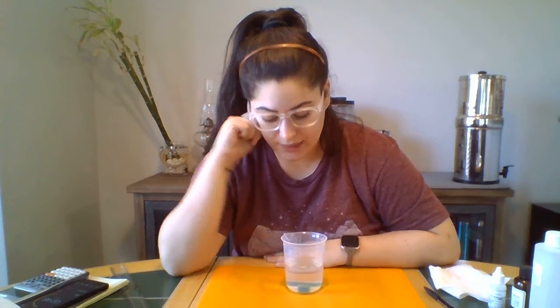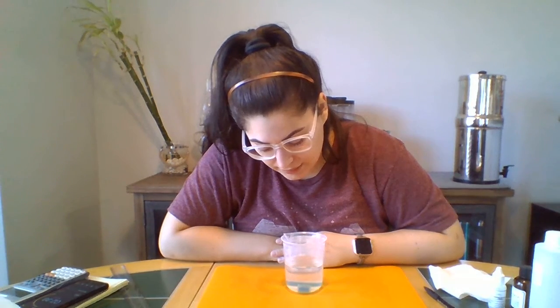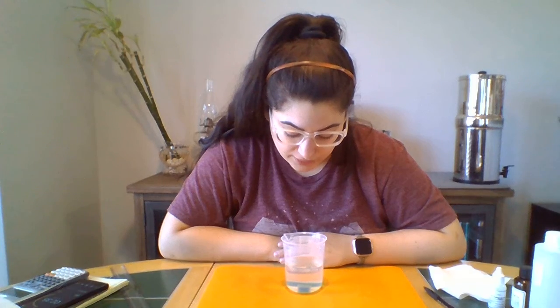Because even the rectangular one, the 1 centimeter by 1 centimeter by 6 centimeters, is longer, and that's not going to change as fast. I think if any of them change completely, it'll probably be the cube. And I guess that would be because it has the smallest surface area. And it has the smallest volume, right? Yeah, so that makes sense.